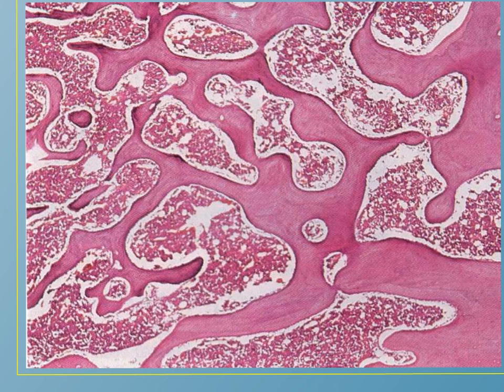This is a picture of the spongy bone, where you can see at first look the multiple irregular bone marrow cavities, characterized by the presence of many fat cells that appear as white empty spaces. And in between these cavities we have the spicules of the spongy bone. By higher magnification you can diagnose the osteocytes in these spicules, while the osteoblasts are present lining the bone marrow cavity. You should know the sites of this spongy bone.